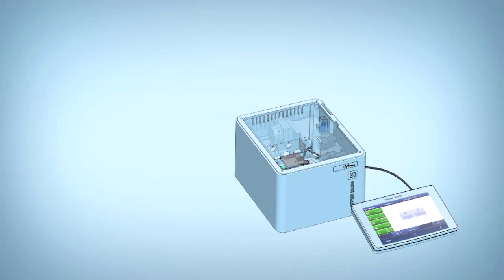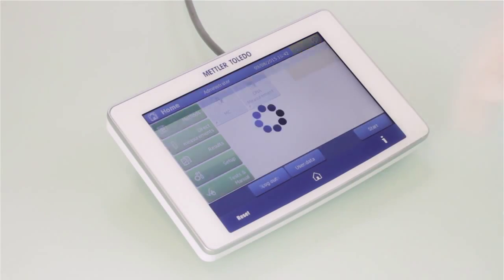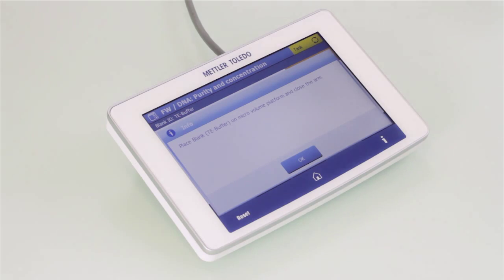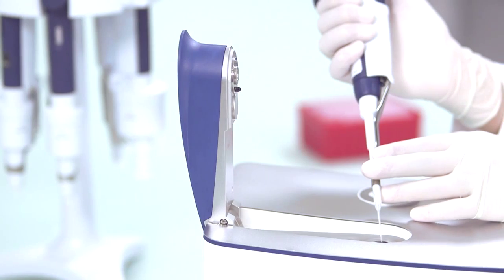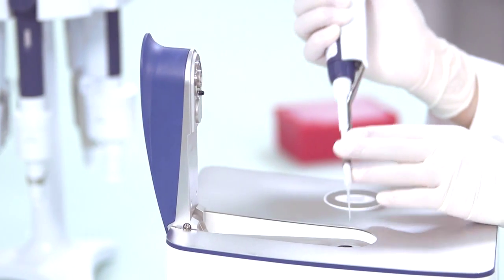Predefined methods can be started with a one click shortcut directly from the terminal. The instrument then guides the user with prompts throughout the whole entire measurement process.